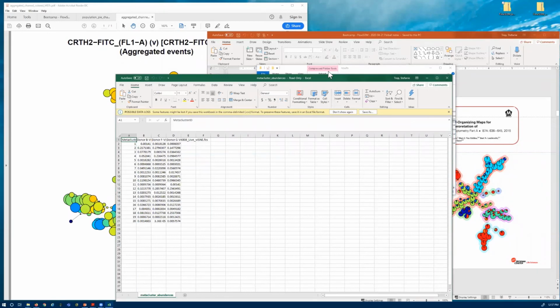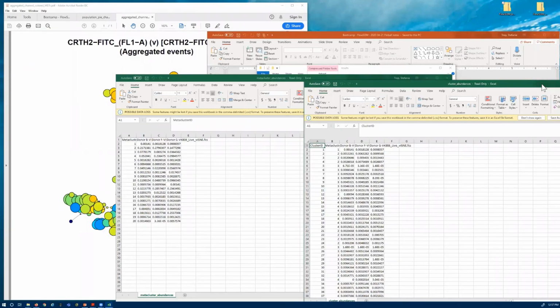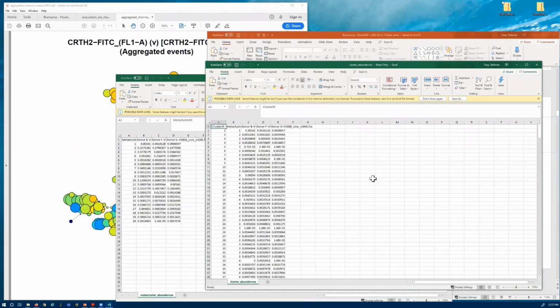And in regard to viSNE, for the statistical export, if you gate on the viSNE population or islands, you can also do statistical export normally as you would with any other population that you manually generated. So there's a lot of ways to do the export, and if you go to our support site, you will get all that information.